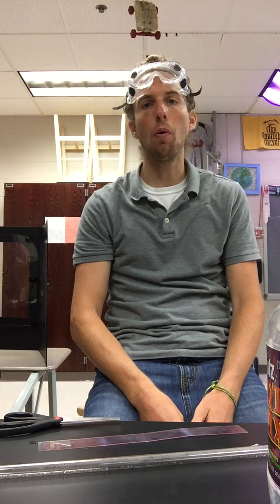Hey everybody, here's your lab video for the ideal gas constant lab. Really important that you have out the data table while we work through this lab so that we can get some information down. Let me set the stage and show you what we have going on.